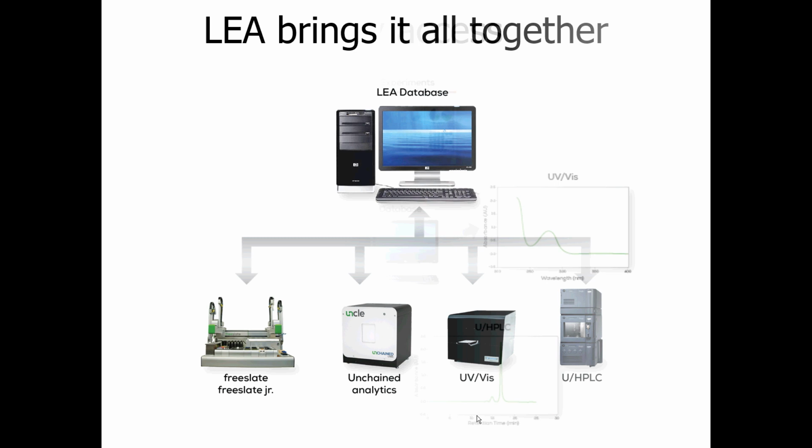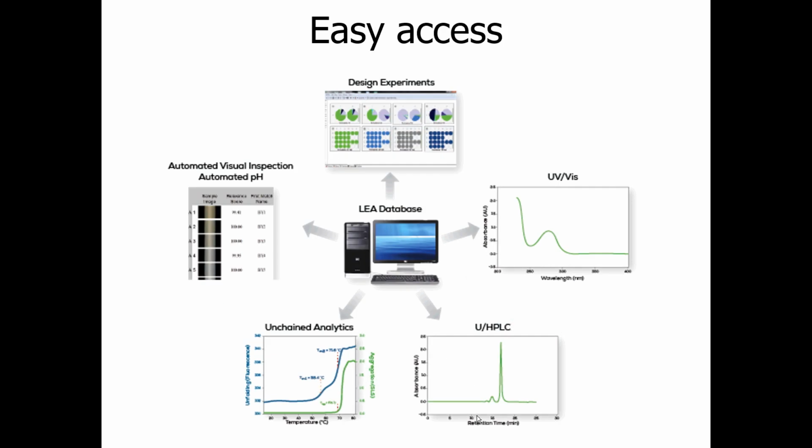So with that information, what you can now do is pull in information from your experiment and every part of the analysis that you do to your sample after that, and have it all possible to visualize and collate the data and look at it all together. So that makes it unique among essentially lab automation software to be able to pull all of this information together down the road.